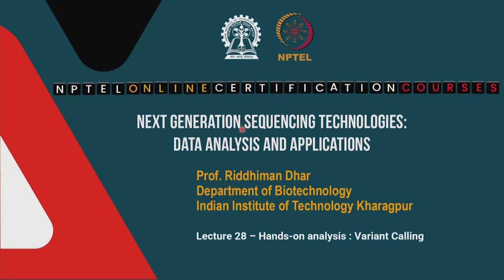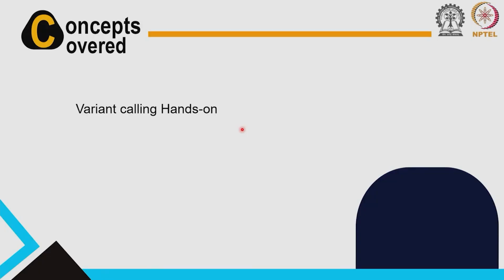In the last few classes, we have learned about how to do variant calling. We have discussed different variant types, and in the last class we focused mostly on SNVs, SNPs and small indels. We have talked about the pipeline that we use, different filtering approaches, etc. In this class the focus will be on doing the hands-on analysis. We will utilize a tool to actually do this analysis ourselves, and we will do some variant calls. This is the topic that we will be covering in this class.